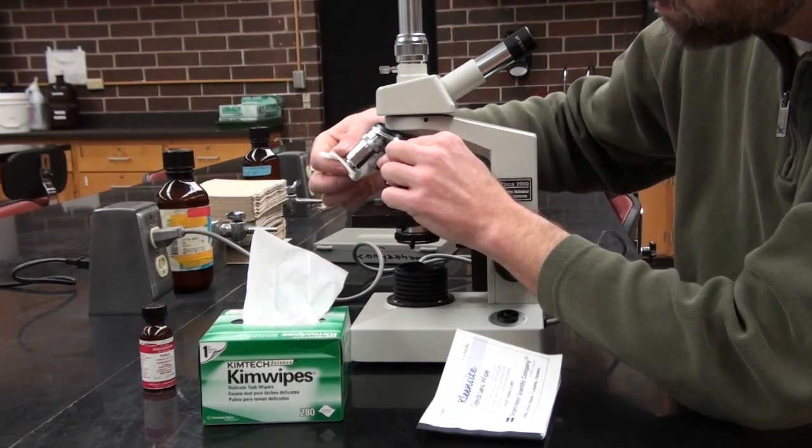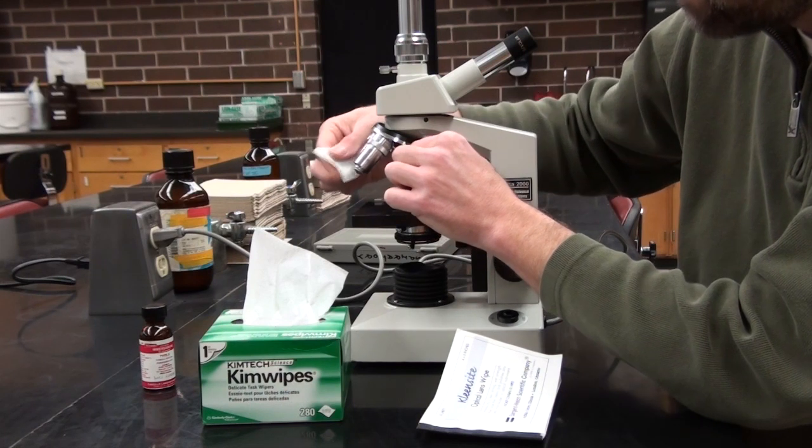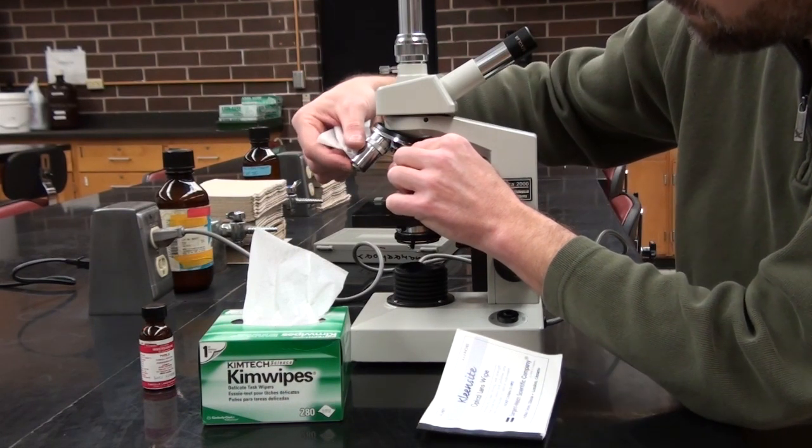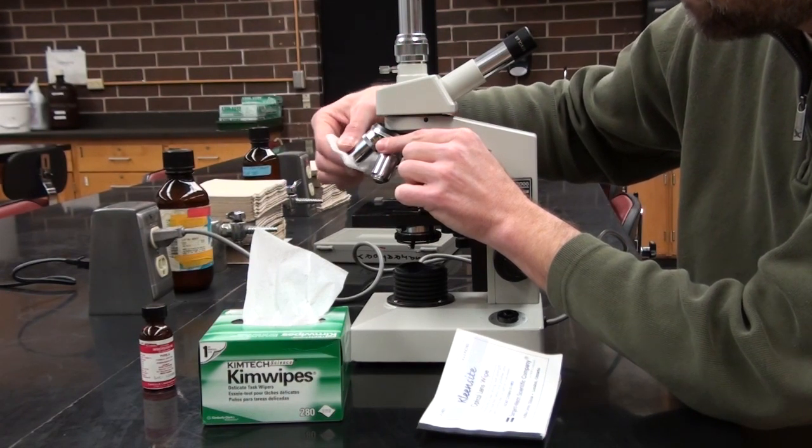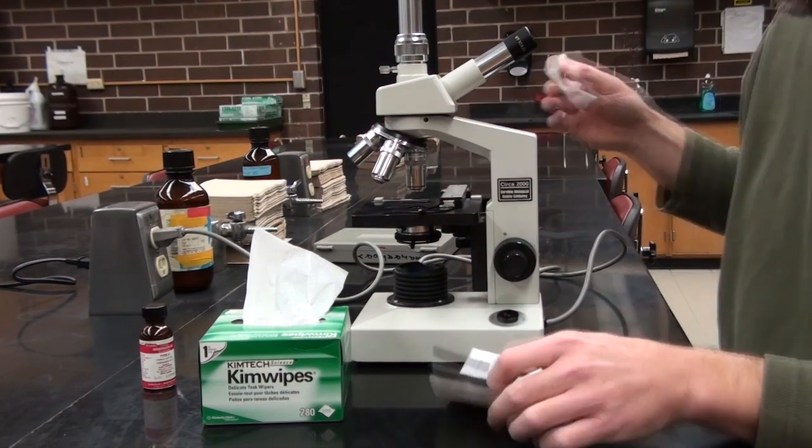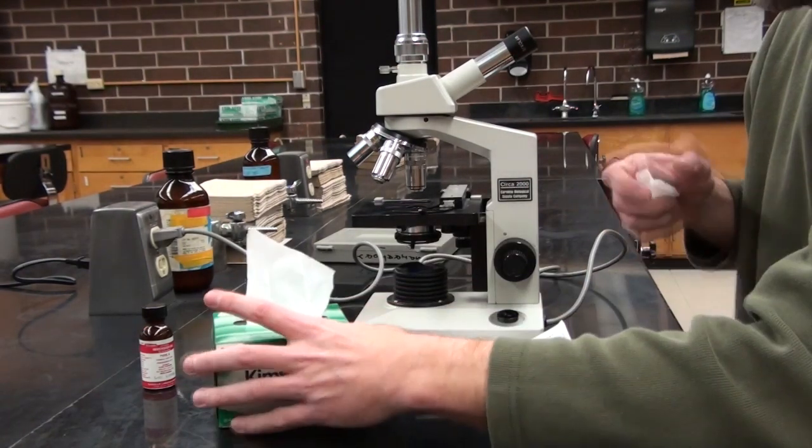Under here for the objectives, you'll just want to gently wipe. Sometimes these do get dirty. Notice in some of these this does push down, so just be aware of that. But a lot of times the objective lenses can get dirty and you can clean them, but you will always use the optical lens wipe. Never use the chem wipe.